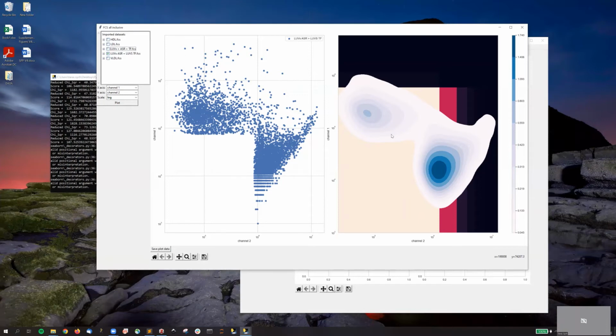This is how this approach can be used for single particle profiling. And pretty much if instead of fluorescent markers, you use some protein loading or you get your extracellular vesicles, for example, and you want to study how much protein of a certain type is over there, you can use this as a kind of nanoflow cytometry.